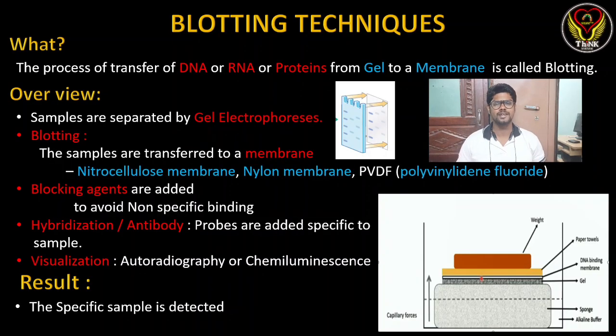Video, we are going to understand the overview of blotting techniques. There are different types of blotting techniques, but in this video we are going to look at the common steps and what blotting is. First, blotting is the process of transfer of DNA or RNA or protein from a gel to a membrane.